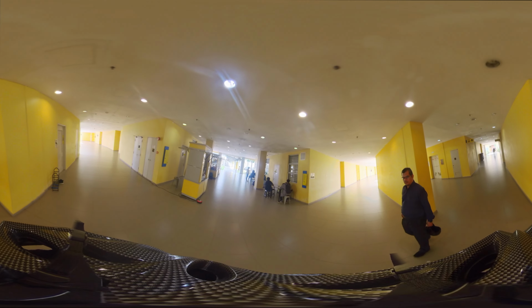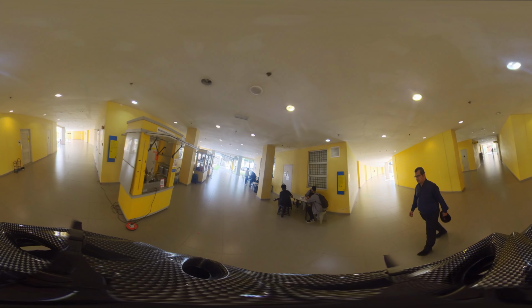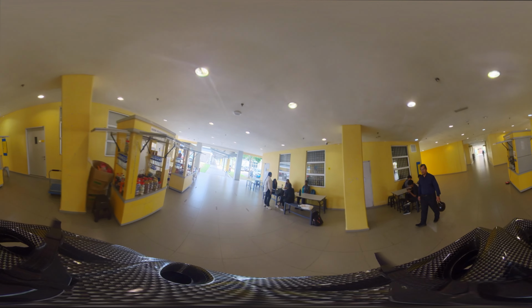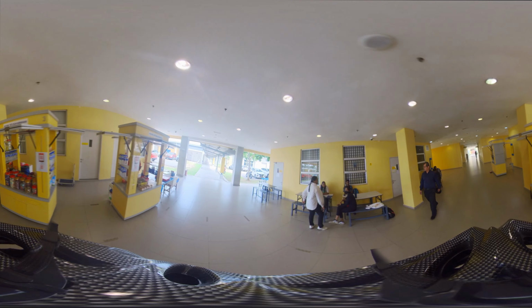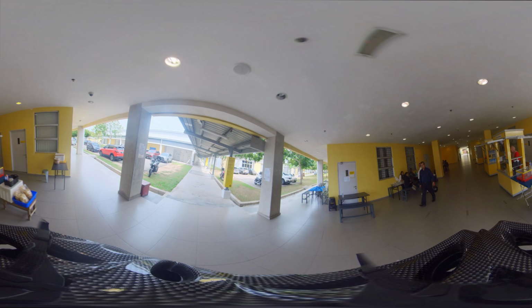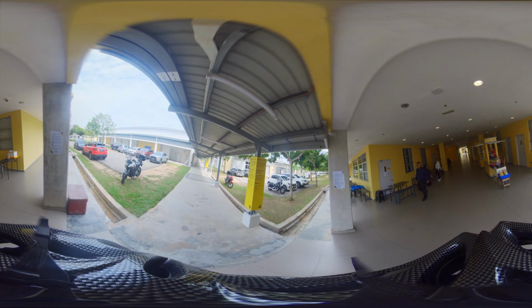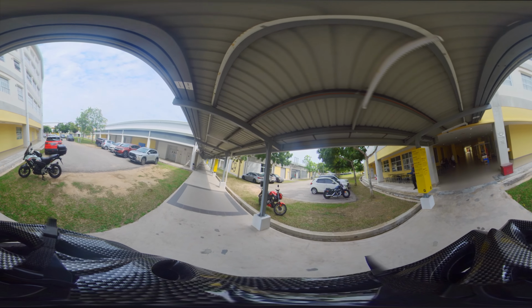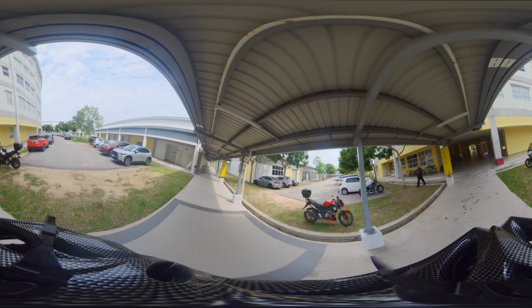As you can see, our objectives include enhancing your hazard identification skills, applying theoretical knowledge to a practical environment, improving decision-making, and engaging in interactive learning. By the end of this tour, you'll be able to identify 12 common hazards, assess their severity, suggest mitigation strategies, and demonstrate a strong awareness of laboratory safety.